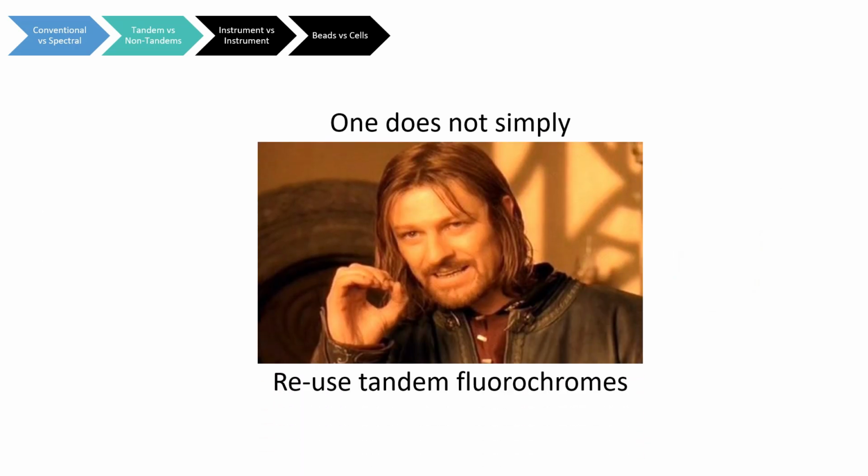What I am getting at here is that the signature of the tandems can vary between company, category number and even lot number. For this reason, we recommend you do not use one tandem as a reference for a different tandem. If you do, then it is essential that you verify that the signature of the fluorochrome in your reference is identical to the one in your sample.